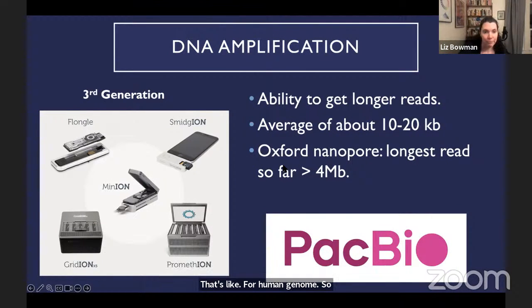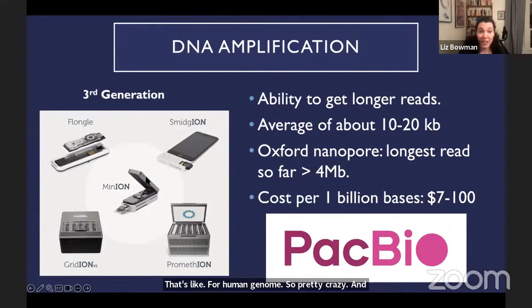So pretty crazy. And then it's also cheap. So it's really good. And then you have these ones that are personal, like this MinION, which is crazy and I'm really excited about. It costs about $1,000 to get the starter pack to do at home, and you can just plug it into your computer and sequence stuff at home. I really want to get one, but I'm trying to hold off for a bit. So much more accessible to people.